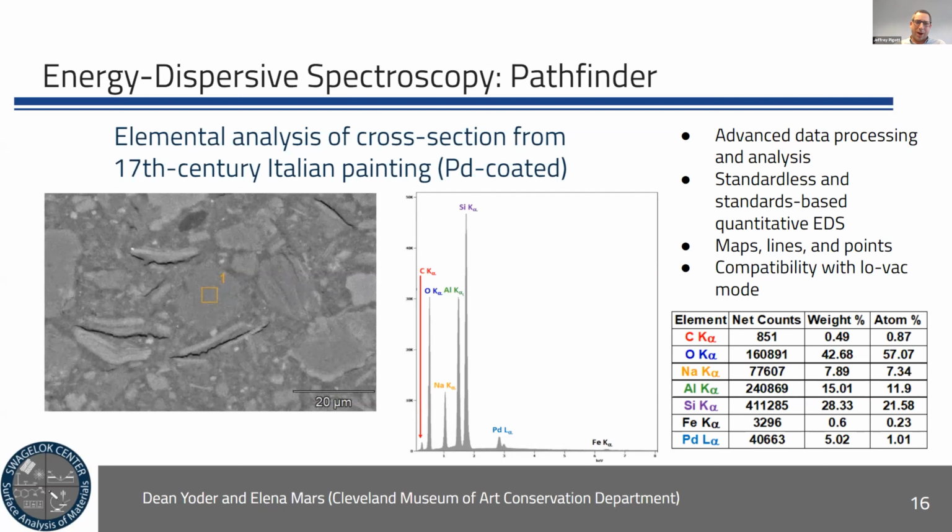In order to do that restoration, they really need to know if there are fossils present in the paint layers, or what the mineralogy is of the paint layers. In this case, this was a polished paint section that we did do palladium coating on because we didn't expect any of the elements to interfere with that. So that was the appropriate technique.